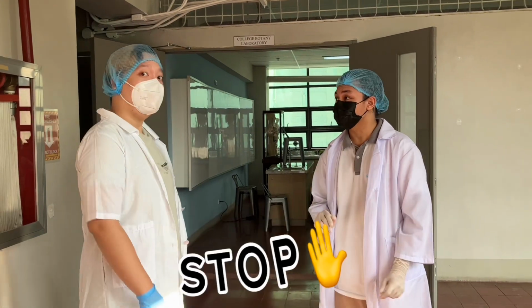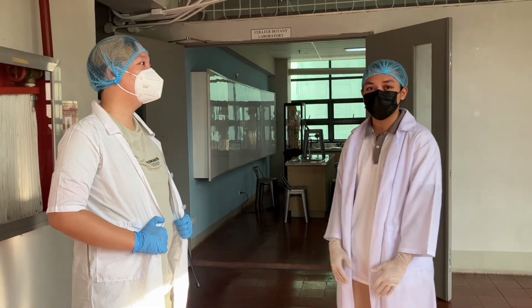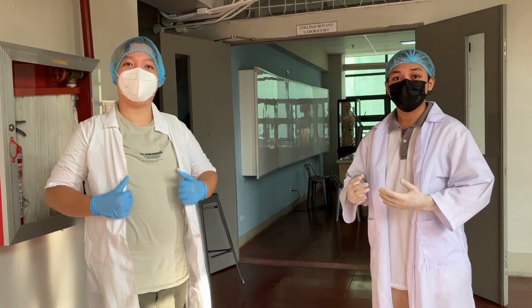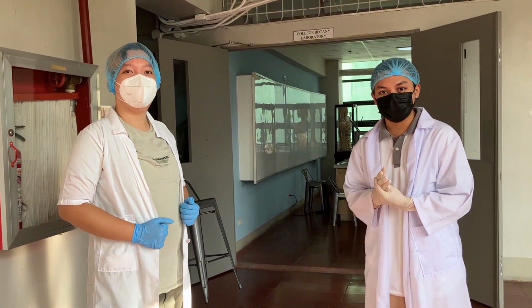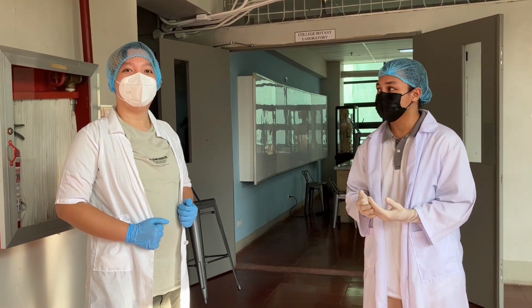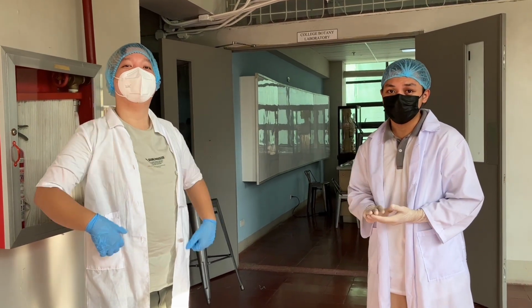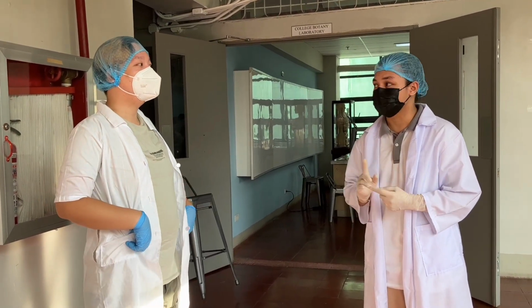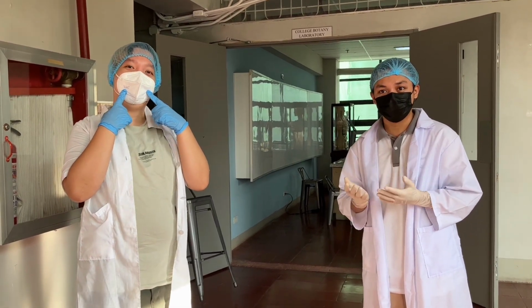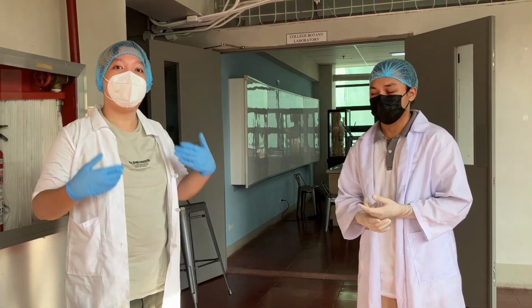Stop! Oh, hi partner. So first, before we enter the laboratory, here are the things we need to ensure. First, our lab gloves. Why? To protect us from the direct contact from the chemicals we will be using in the laboratory. Next, our hairnets, to avoid hair follicles from falling in our experiments. Third, our face mask, to avoid saliva or puff or sneezes getting into our experiments.